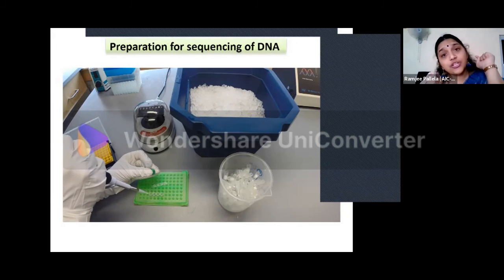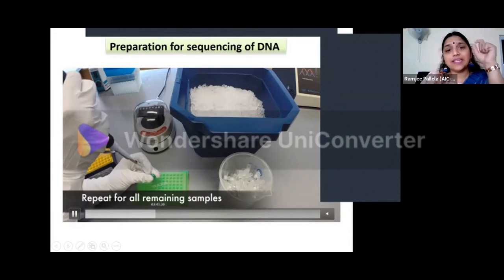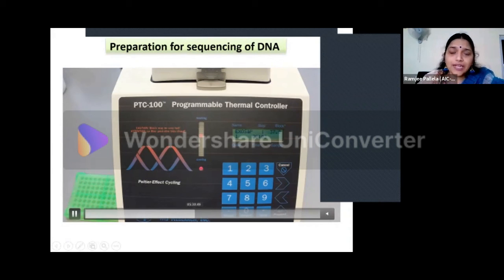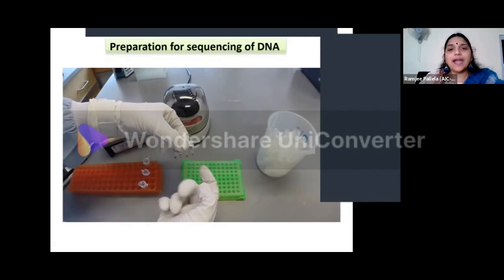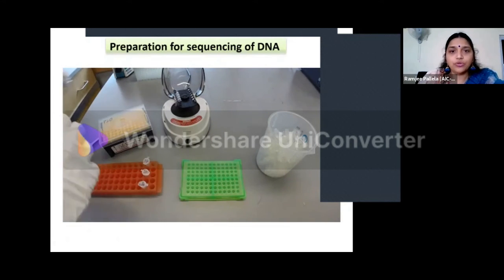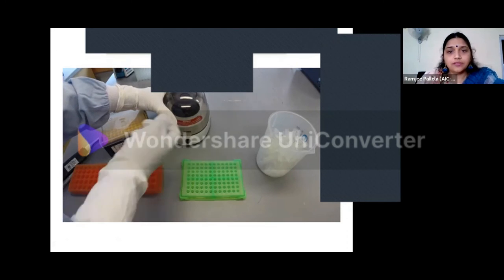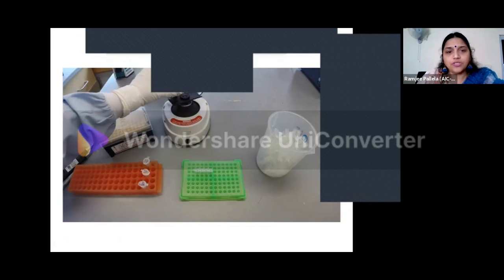Just like the initial phenol chloroform extraction method of DNA, it will take off all the things, leaving your DNA. The same thing will happen here. This cocktail will also remove all of the chemicals that are available in your samples, and once you centrifuge it and take out all the substance from there, incubate it for 16 minutes so that it can chelate all of the compounds, and then you will be left with your DNA samples. As I told you initially, we will be centrifuging it. After mixing it, vortexing it, mixing everything together, just put all of your samples into the centrifuge.